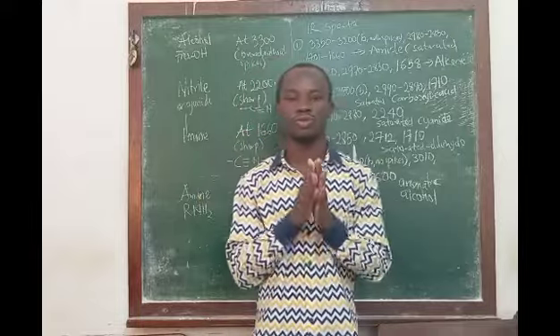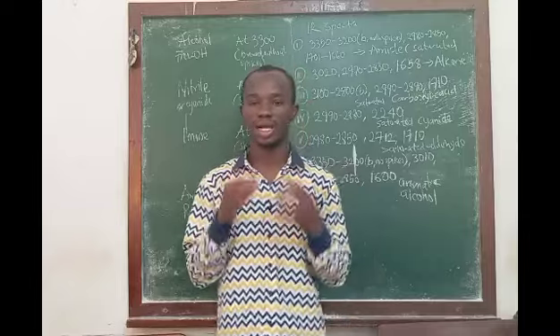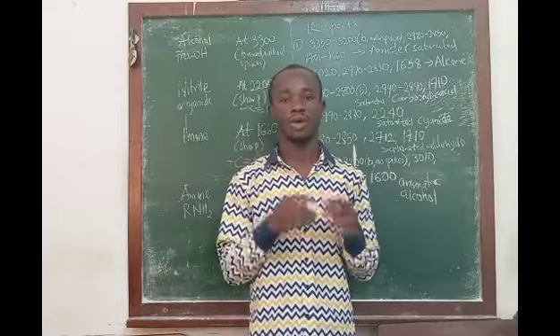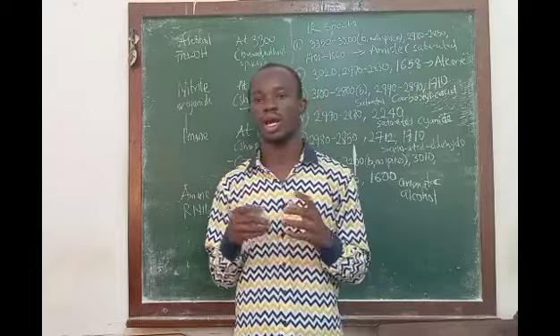And this will be the end of the lessons on how to read an IR spectrum. I believe if you have watched the first, second, and third videos on how to read an IR, you have gained a lot of knowledge and skills on reading IR spectra.